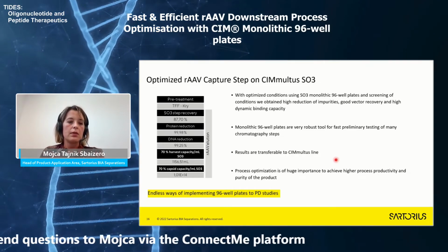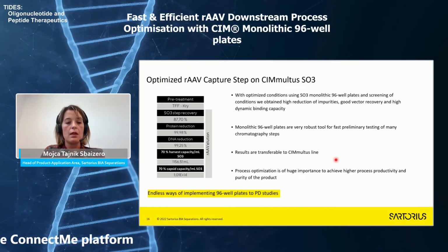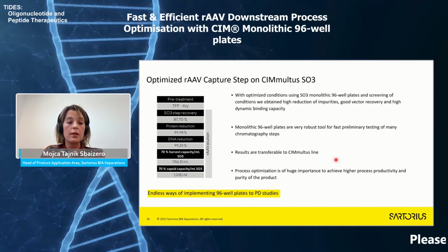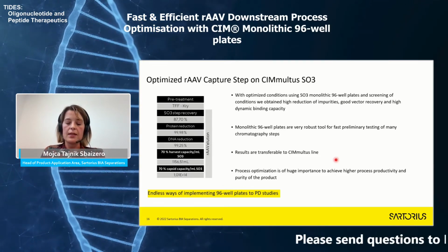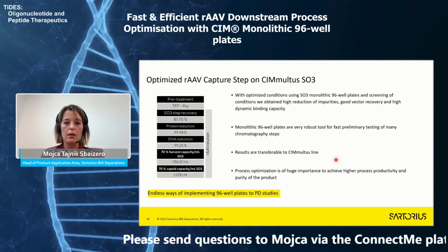Here I was just showing one example of the monolithic 96-well plates that we used in our laboratory. Of course, there are endless ways of doing experiments with these plates. And we are very happy to use them in our process development department.